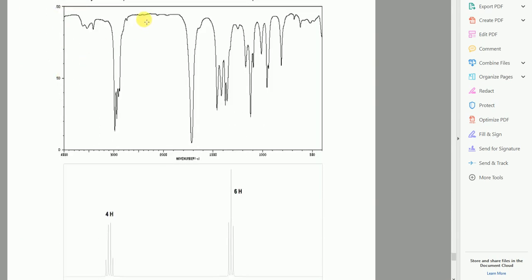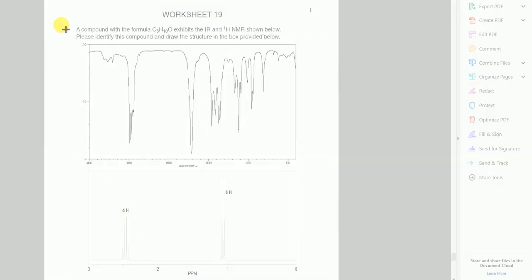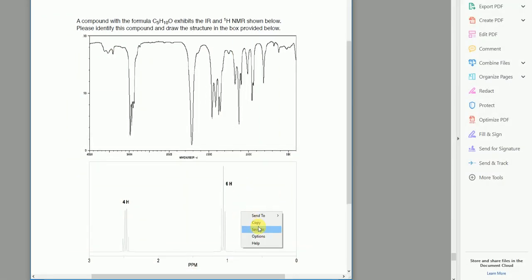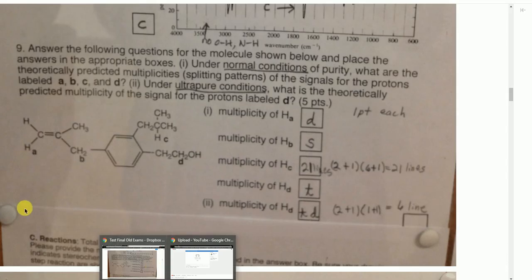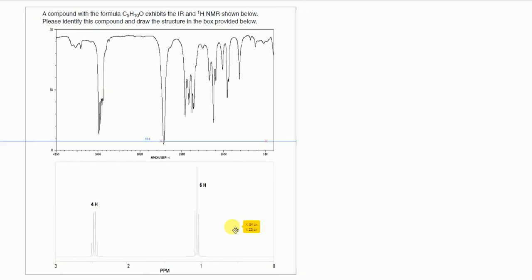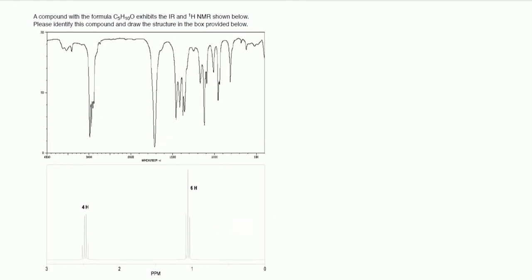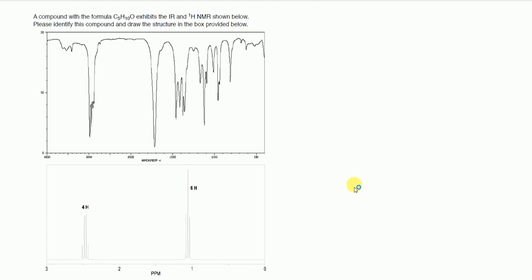All right. So let's take a picture of this. And this is the main problem because it has the most points attached to it. Okay. So, all right. Cool beans. All right. So this is how it's going to look. All right. We're going to learn as we go. The best way to learn is through problems, right? So I'm going to keep teaching you a little bit more about IR and little tricks and spec through the problem and NMR.